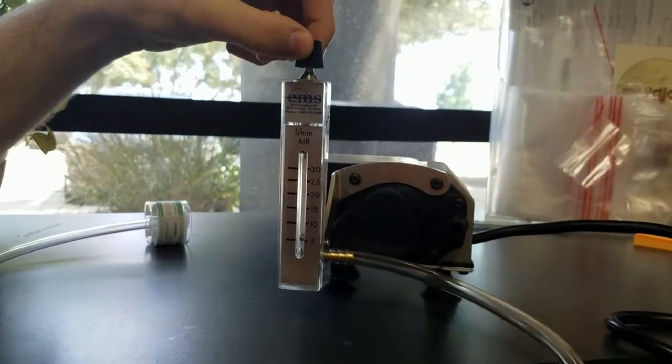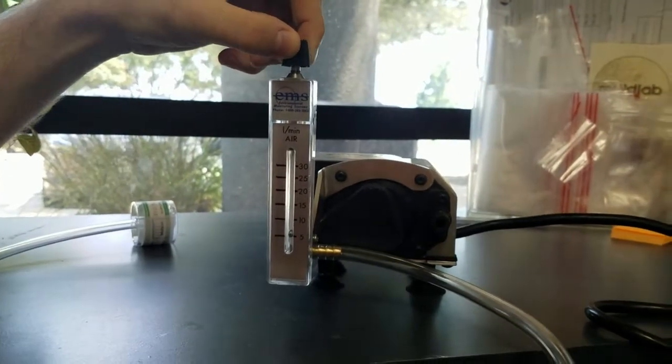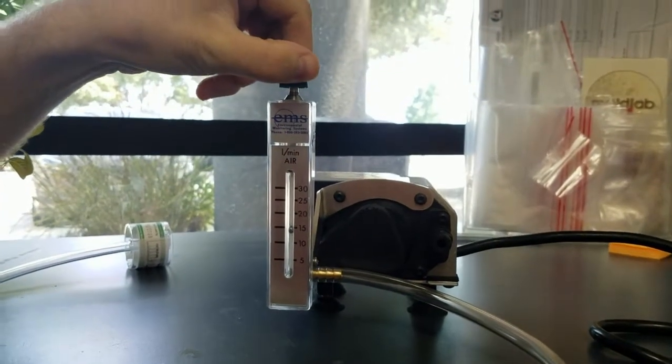Go ahead and plug the pump into an outlet. Make sure the flow rate of the pump meter is at 15. If it's not, you can adjust the flow rate on the meter by turning the black knob on the top.